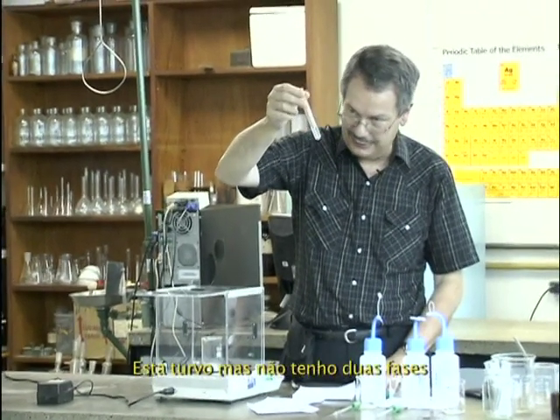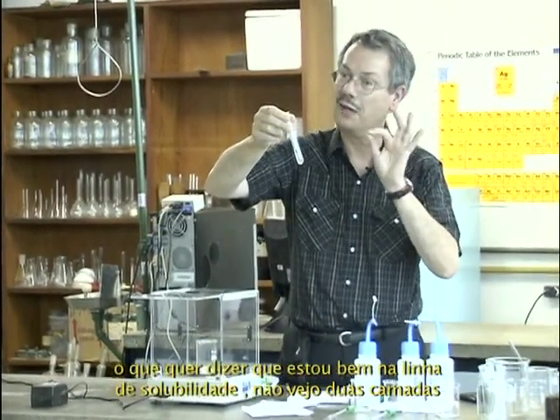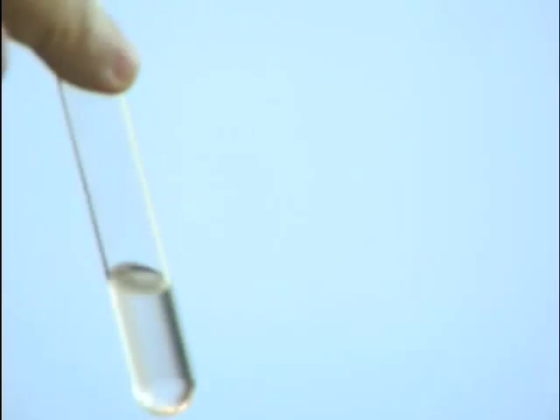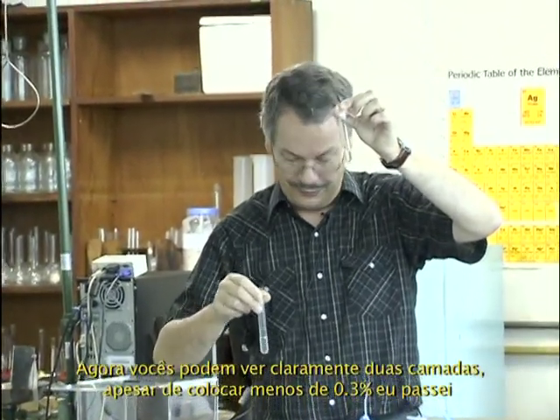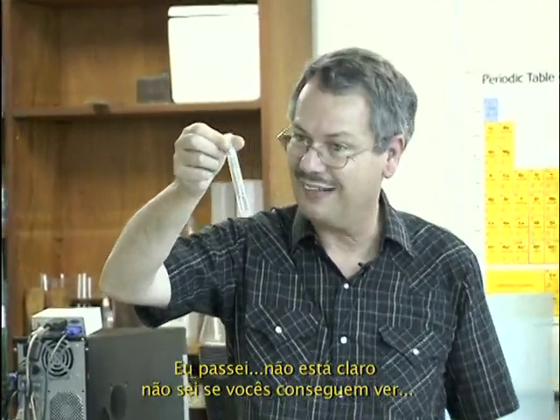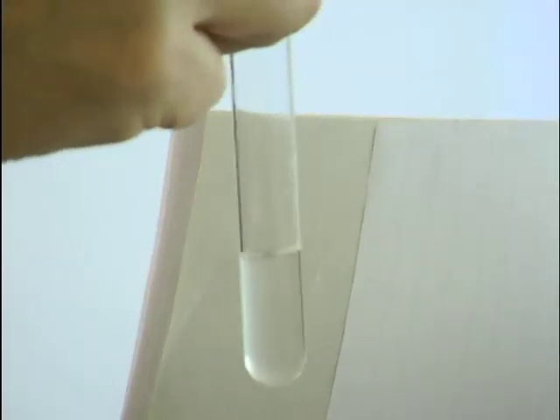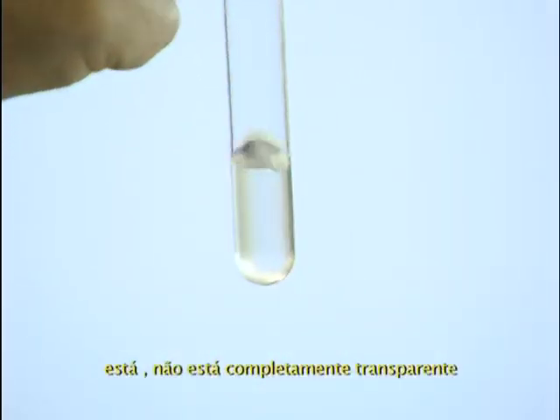You see, it's cloudy, and I don't have 2 phases, which means I am really just on the binodal curve. I don't see 2 layers. On that one, now you can clearly see the 2 layers. So even though I put less than 0.3%, I passed it. This I didn't pass it. It's just not clear. I don't know if you see it better. No, you don't see it. It looks white, but it's not completely transparent.